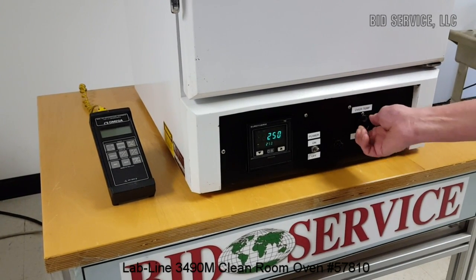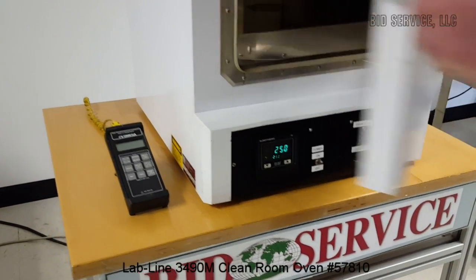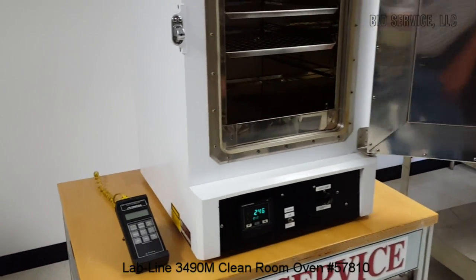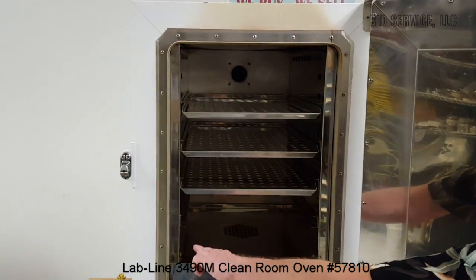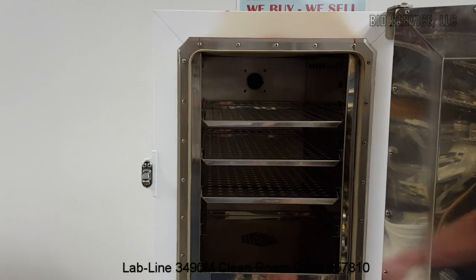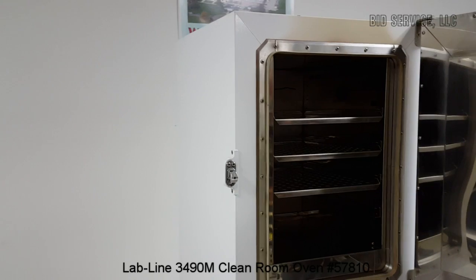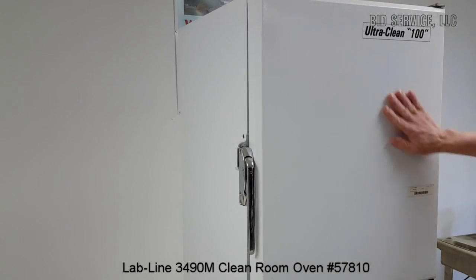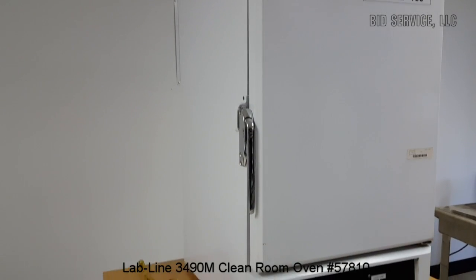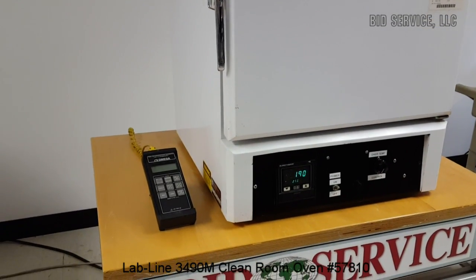We'll take a look inside — it's a little bit hot right now, but it's a very clean system. It has three removable shelves that you can position in about ten different locations, very convenient to use. It is powered by 120 volts AC and will run off of a standard 15-amp service.